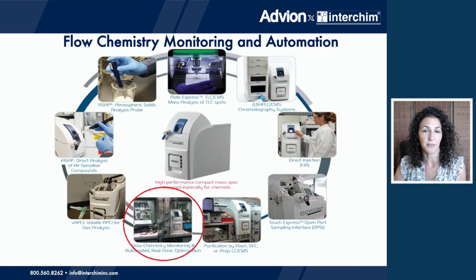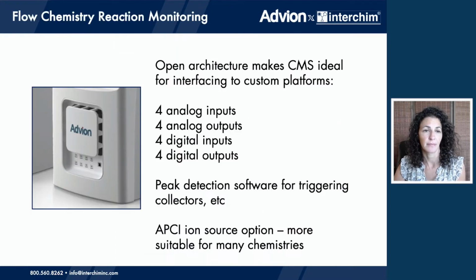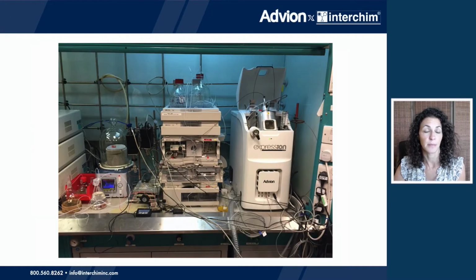Next is an application for reaction monitoring applied to flow chemistry. The CMS can be interfaced to flow chemistry installations. The various inputs and outputs can communicate and control other modules in your flow chemistry setup. The peak detection software can trigger collection or other events in your process. Here is an example of a custom flow setup. It may look a little like a Frankenstein system, but it gets the job done.